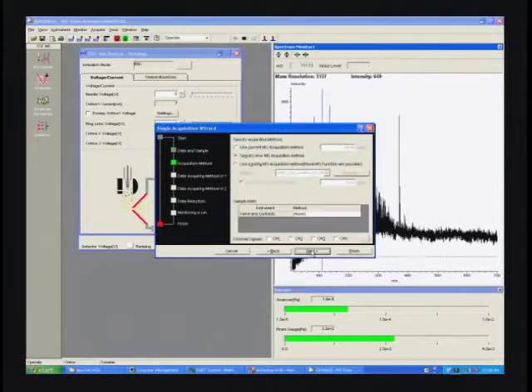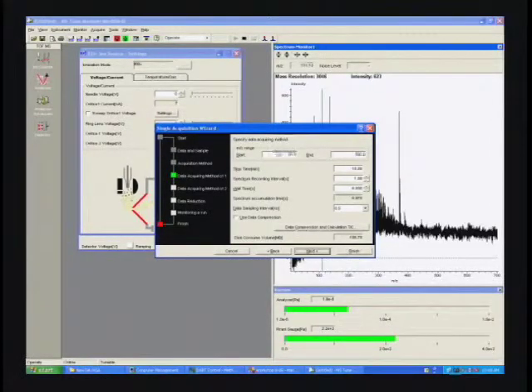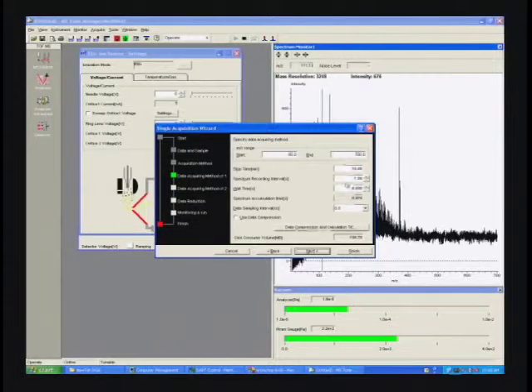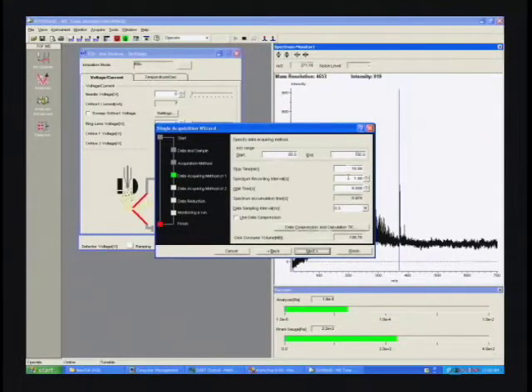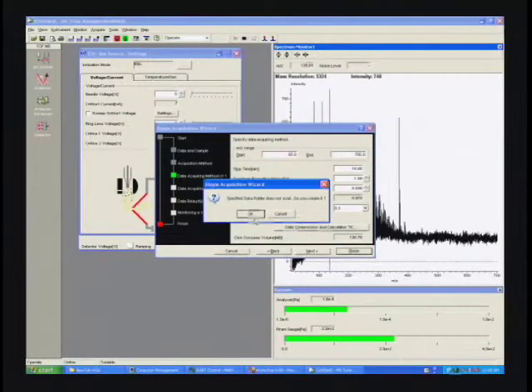Okay, the rest of the pages are optional, but we're going to just collect data from m/z 60 up to about 700. The machine will run for minutes unless I hit the stop button, and we'll save spectra about once a second. We can go as fast as 10 spectra per second, but we aren't going to gain much for this analysis. And then we'll hit the finish button.